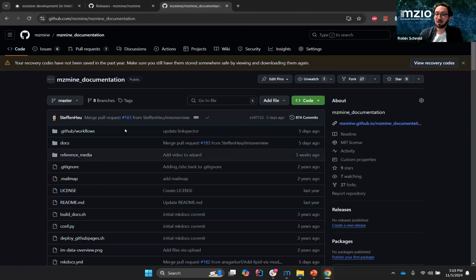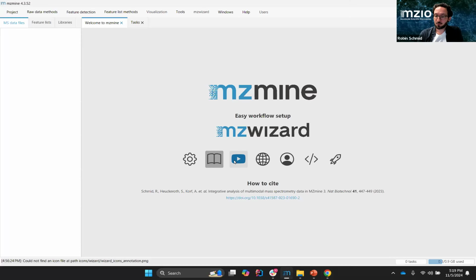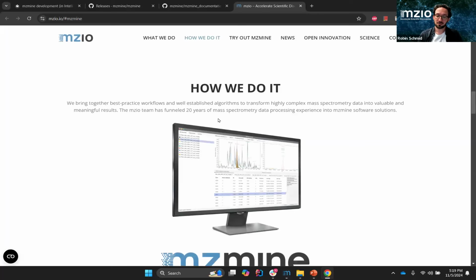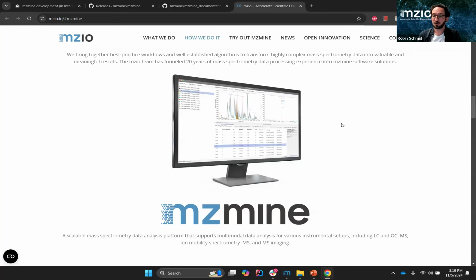It's all markdown, so you can very easily add information here. Then, of course, we have YouTube, where we also upload videos and where we also link out to new videos by the community. And we have the mzio website. And on the mzio website, you're also going to find additional information for mzmine and also for the services offered by mzio.